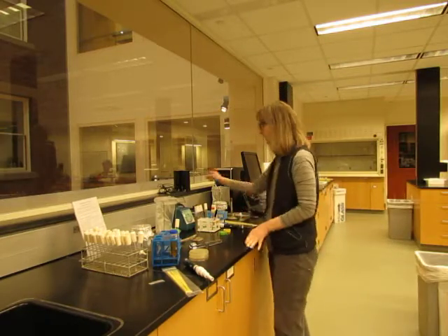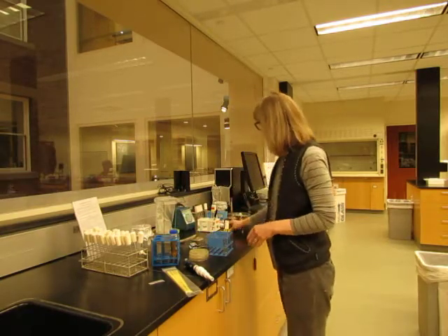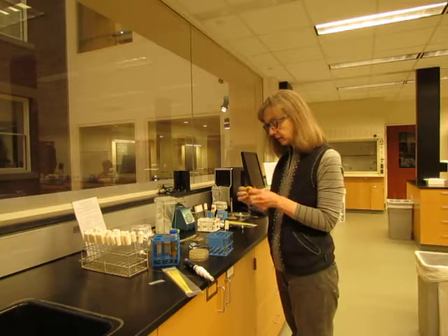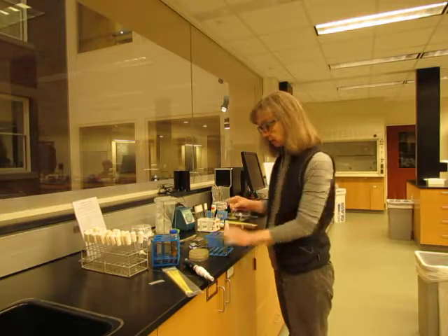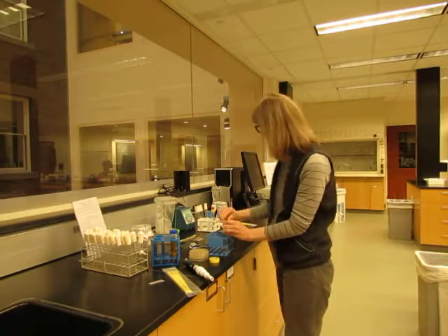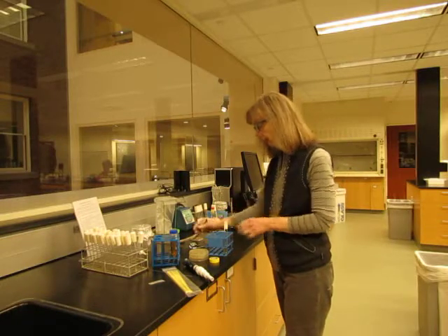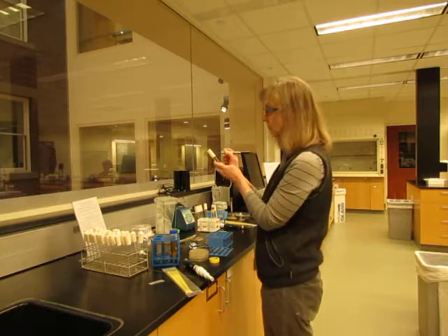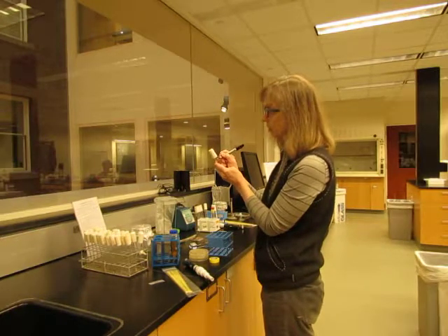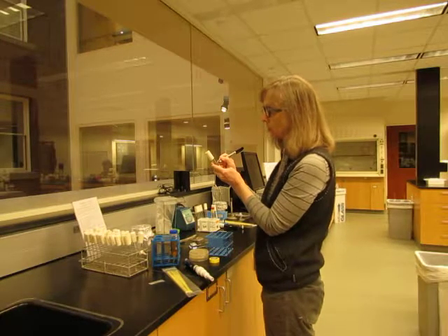Now that I have my culture started, I can turn off the flame, and then I want to identify the culture. Use a small amount of tape on the top of the lid to identify your group. That'll make it a lot easier to pull your cultures out tomorrow when they're ready. The rest of your identification should go on the tube itself — your strain number and your group number again, and then whether you had high or low media.